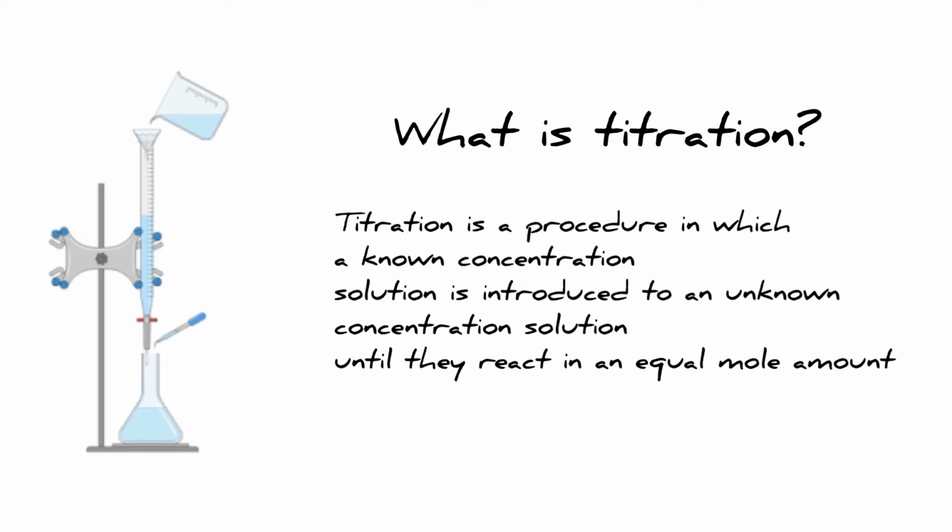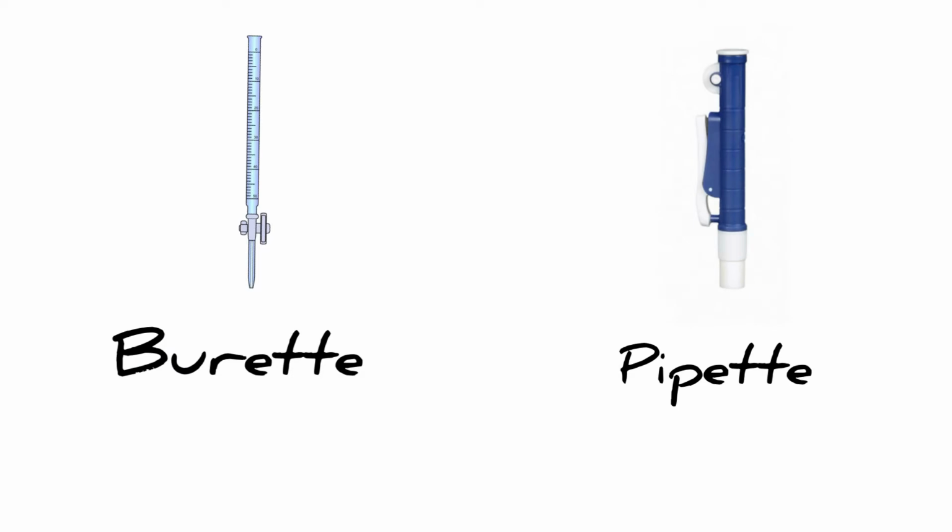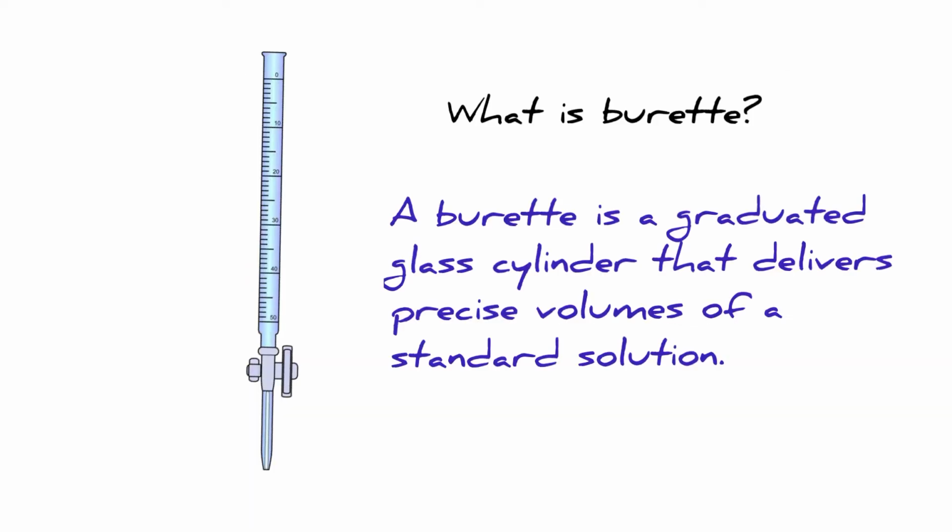Titrations necessitate the use of specialized equipment: a burette and a pipette. Burettes and pipettes distribute highly exact volumes of solution, increasing the analytical technique's accuracy. A burette is a graduated glass cylinder that delivers precise volumes of a standard solution. A burette accurately distributes a precise volume of standard solution, the titrant, into the conical flask. Using the stopcock, the solution is dispensed gently.